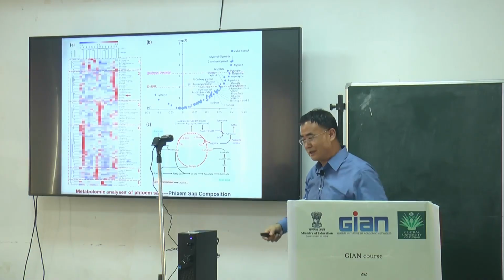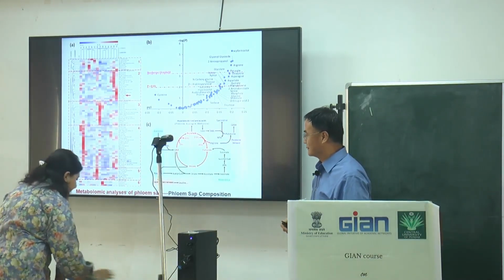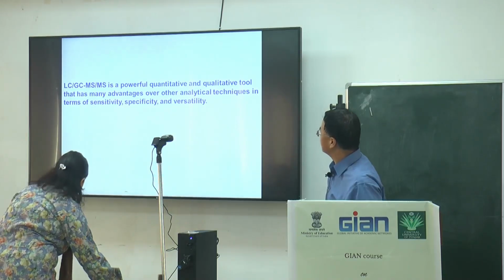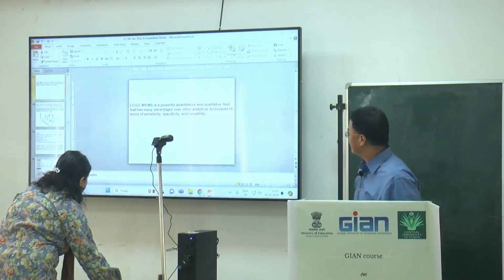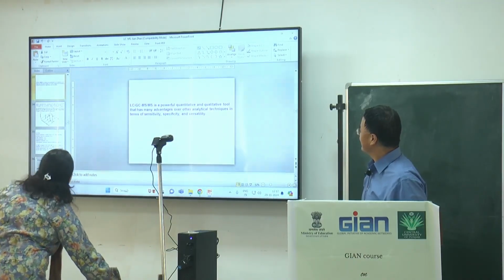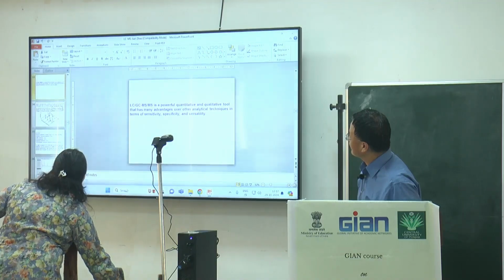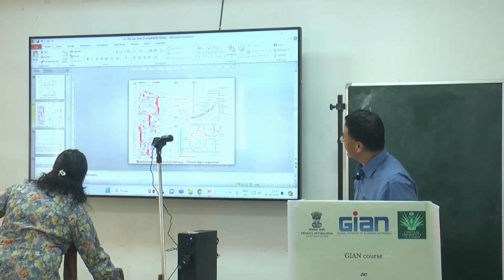Usually we see the amino acids moving from the root to the top, the first one.